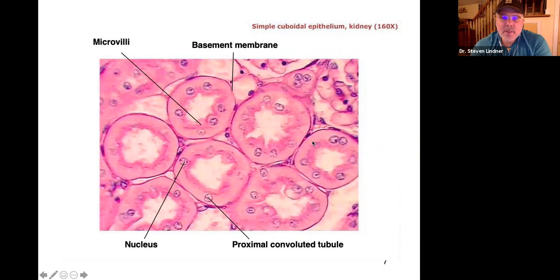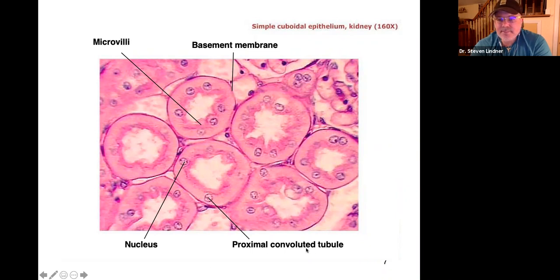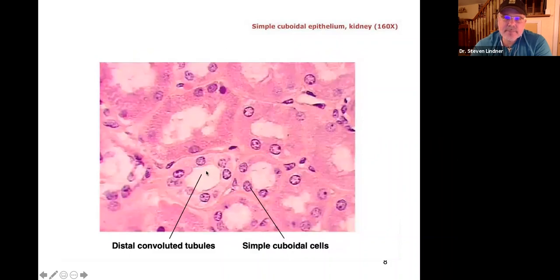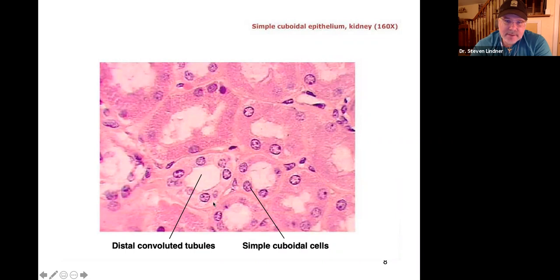Here we see a bunch of lumens — circles. What surrounds them? They're not flat, not columnar — more cube-shaped. This is the proximal convoluted tubule, which we know is in the kidneys, and those always have simple cuboidal epithelium. Here's another kidney image with multiple lumens, each surrounded by cube-shaped cells: simple cuboidal epithelium once again.